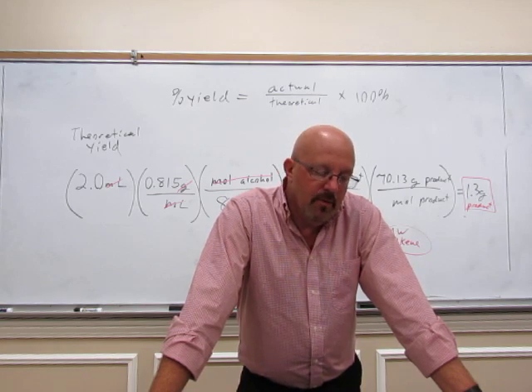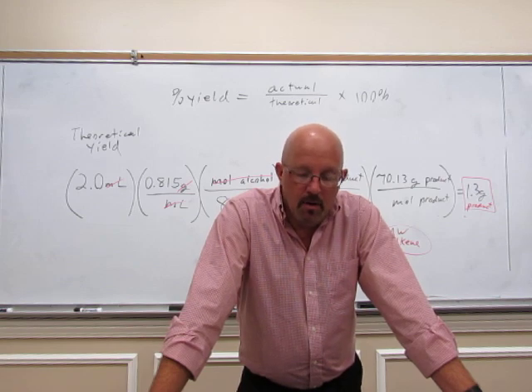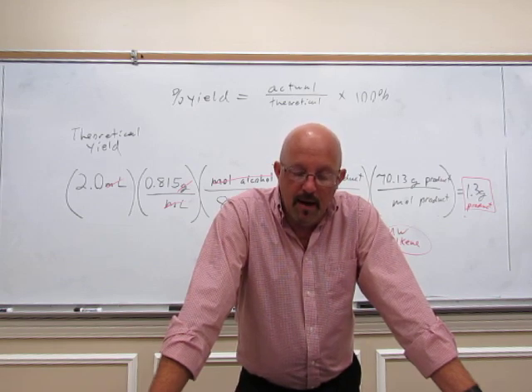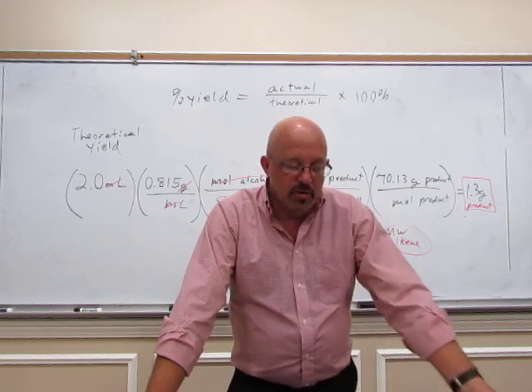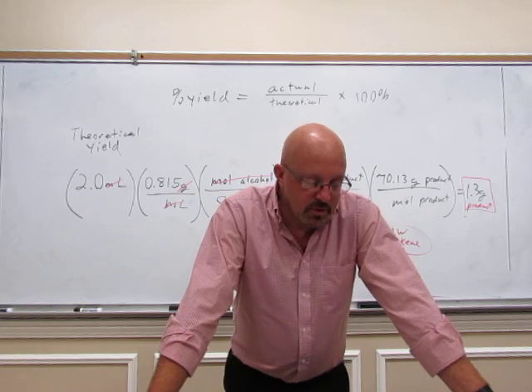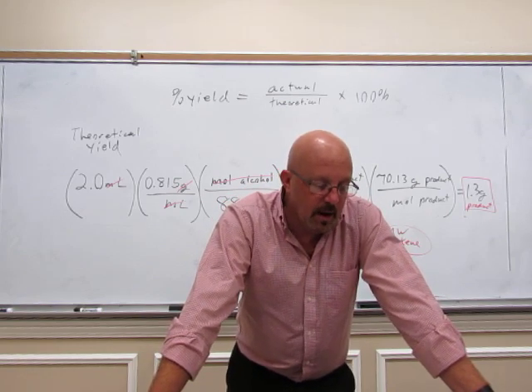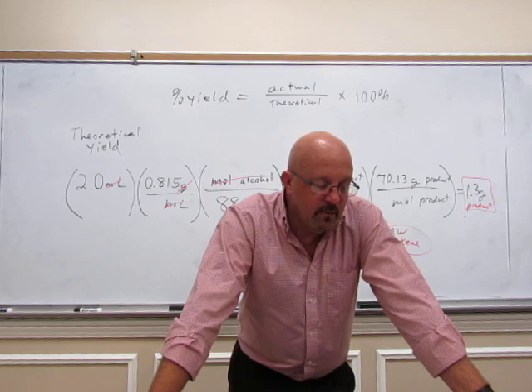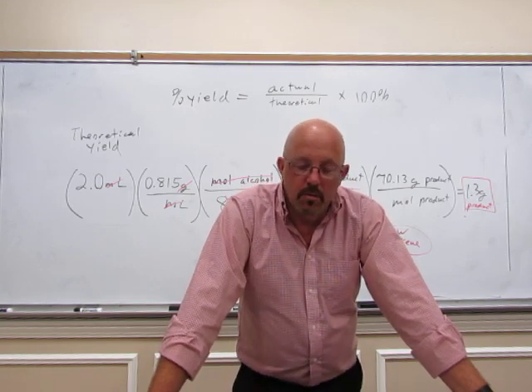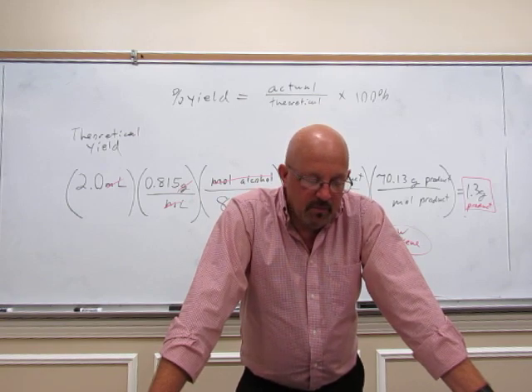Now when you talk about the peak, so if you look at our reaction, the alcohol should go away. We're converting the alcohol into an alkene. So an alcohol should have an OH stretch, and the OH stretch is this week. I'll give you the spectra when you come to lab. I have it here, and it says it's at 3369 reciprocal centimeters. So in your conclusions, again, talk about the spectra.